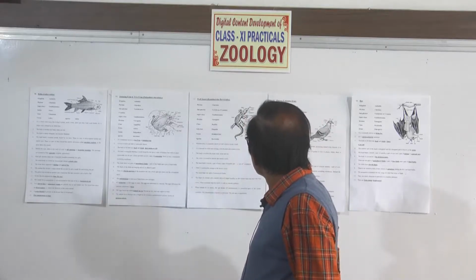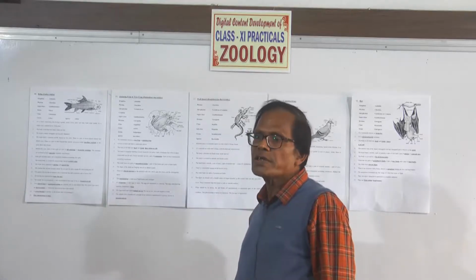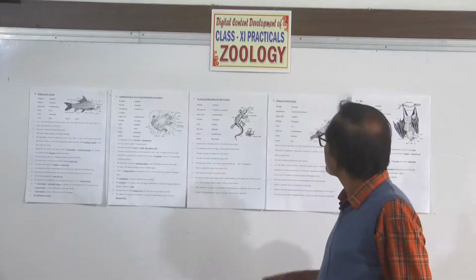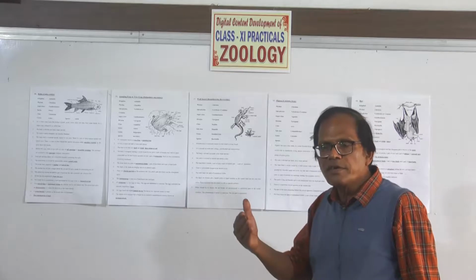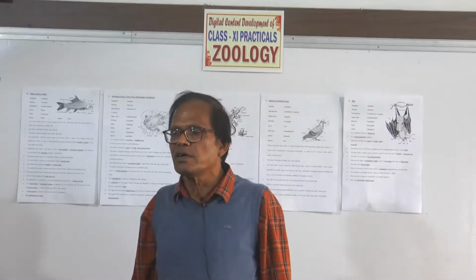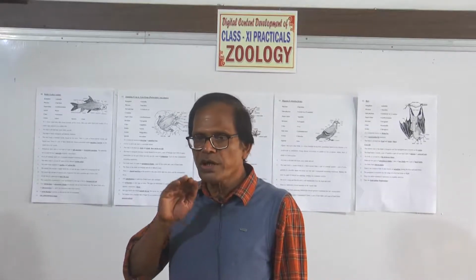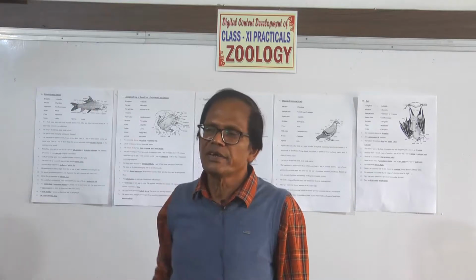The head bears a pair of eyes, a pair of external nostrils, a mouth bound by two hinged jaws. From the mouth protrudes a tongue. It can be termed as a prehensile or protrusible tongue, rather. It can protrude its tongue, throw it on the insect, and eat it.